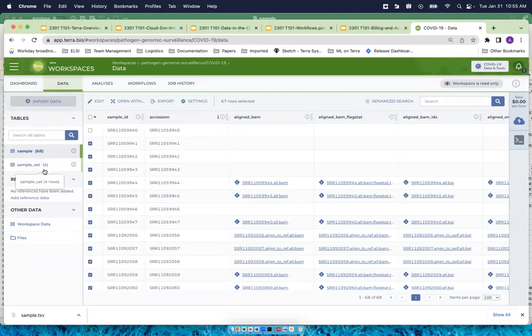And that's to answer one of the questions that someone just asked about how to combine different tables. To my mind, the easiest way would be to just download both tables, copy paste them together, and re-upload them. So, an extra 30 seconds of work. There's not a pretty way of doing it. But yeah, that's the way to do it.